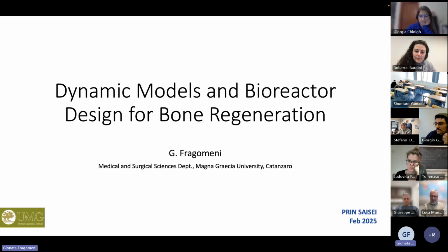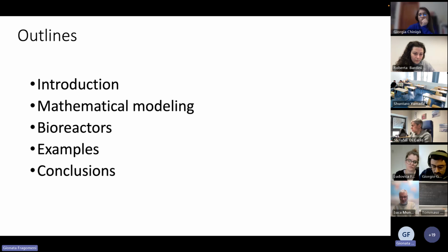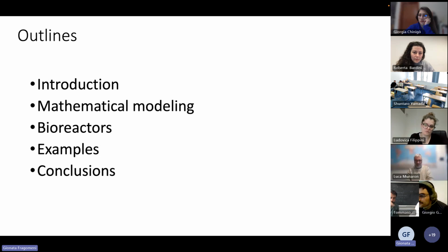I will talk about dynamic models and bioreactor design for bone regeneration. I have a brief introduction, and I describe the mathematical modeling, what a bioreactor is, very shortly, and I explain the examples and give the conclusion of my work. It's a very rapid presentation, and I go.